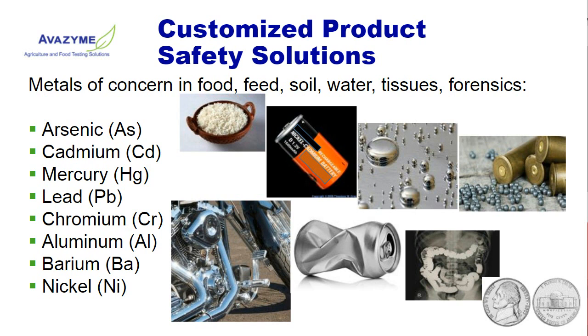But there it is applied to the patient in a completely water-insoluble form as barium sulfate, and is passed through without bioaccumulating in the body. And last but not least, nickel. Some people are very allergic to nickel, and nickel is found in a variety of alloys, and that's how the American coin got its name.